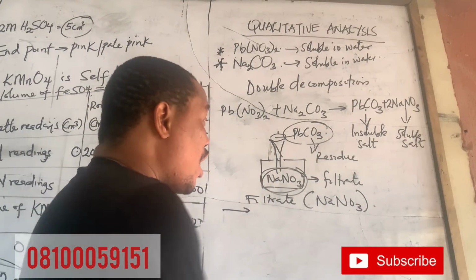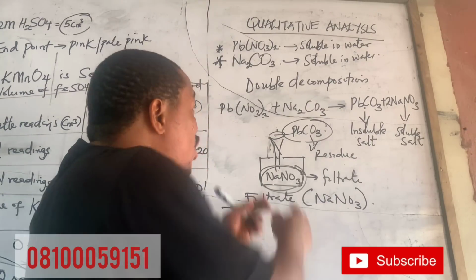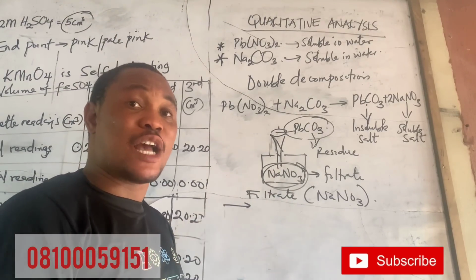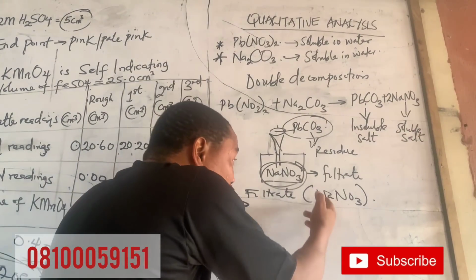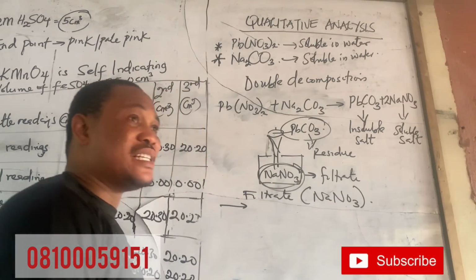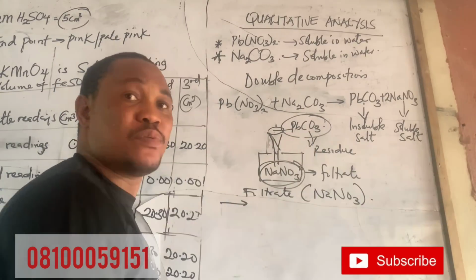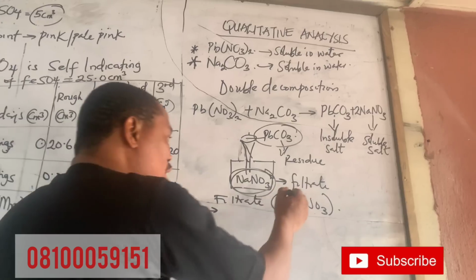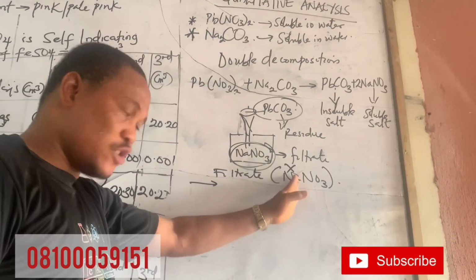and I think it should be 95% true, because if they wanted to test for sodium ion, they might not have told us to mix it together. I've even done that last year. If you check the NECO video last year, golden flame sodium, we did it. So if they ask you to test for it, maybe they'll ask you to dip the spatula in this sodium nitrate and put it in a flame. You will see the golden flame, but I'm not expecting this. That's my prediction, but if you see it, you should know it.